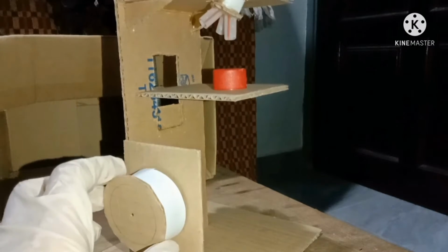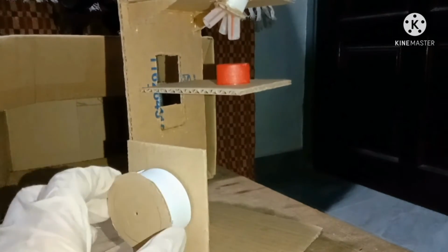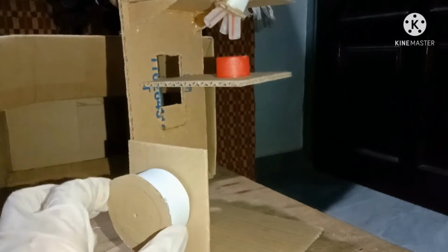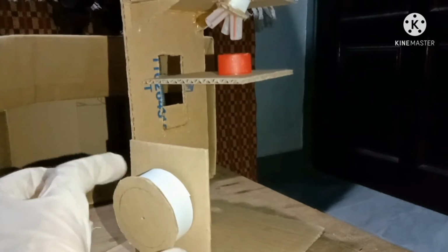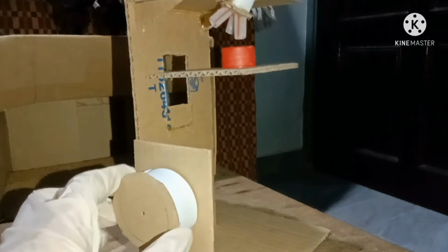For the next step, we bring the specimen or the sample up, near to the microscope lens so that it will be more focused on the specimen. Be reminded, do not touch the microscope lens. For this step, we adjust the objective lens so that we can see the sample with a clear image, and then we can proceed with our experiment.